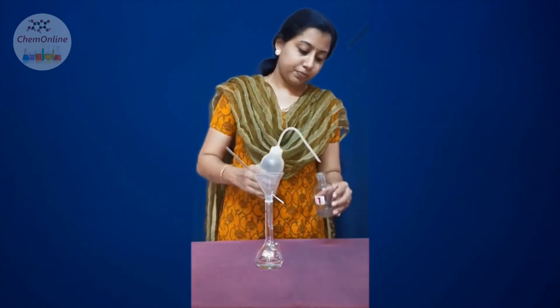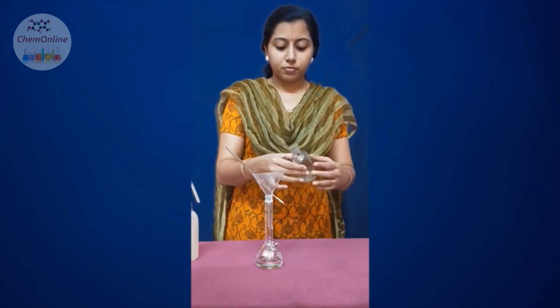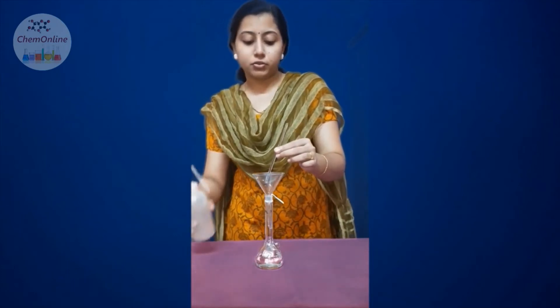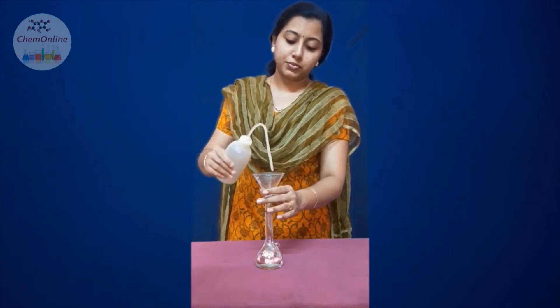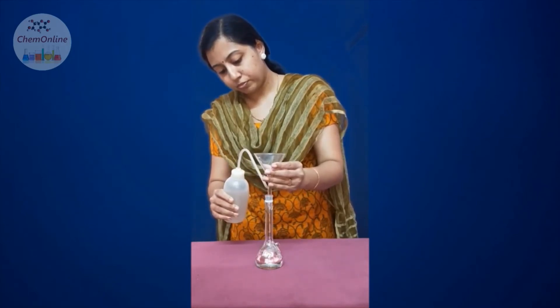You should use the minimum quantity of water and wash the bottle a maximum number of times — repeat this washing at least three or four times. Again add a very small quantity of water along the sides, rinse it, and transfer the solution through the glass rod. After three to four washings, wash the glass rod as well. Then wash the walls of the funnel, carefully remove the paper, and wash the tail of the funnel also.